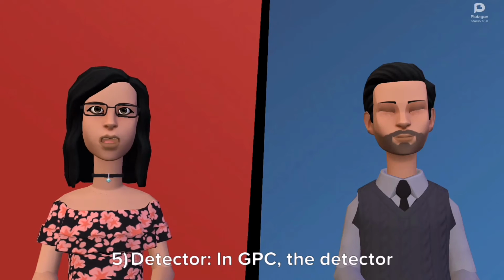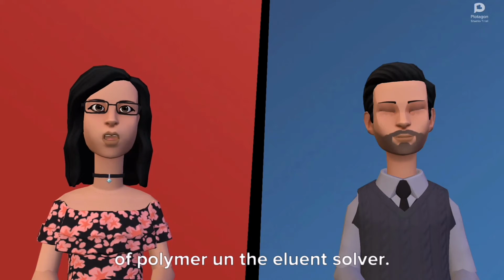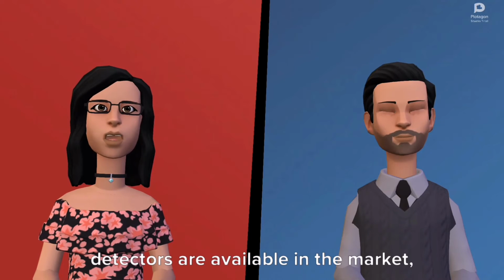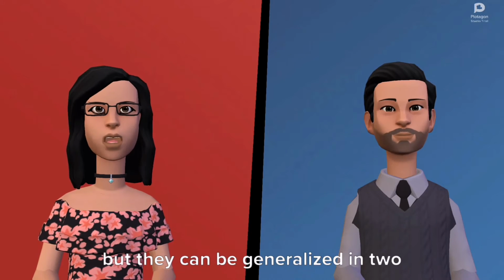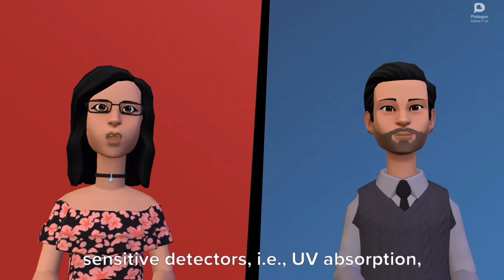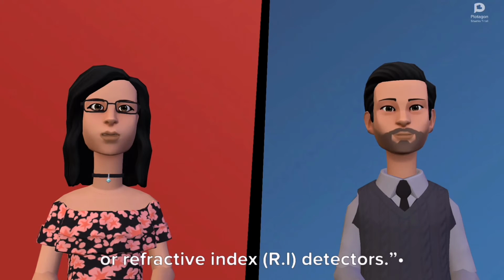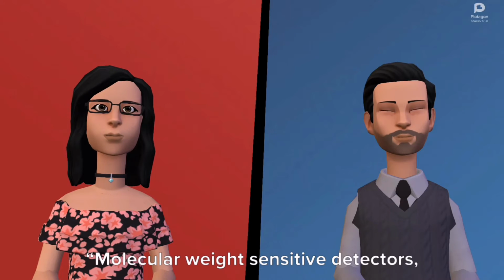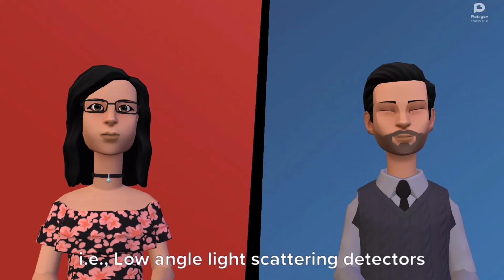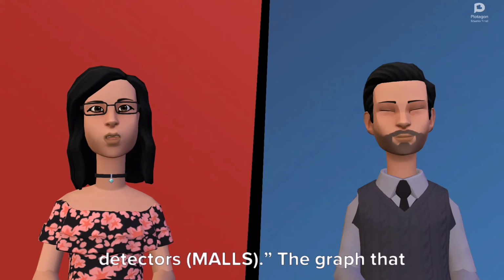5. Detector. In GPC, the detector is used to determine the concentration of polymer in the eluent solvent. Although a wide range of detectors are available in the market, they can be generalized into two major categories. Concentration-sensitive detectors, that is, UV absorption, differential refractometer, DRI, or refractive index, RI detectors. Molecular weight-sensitive detectors, that is, low-angle light scattering detectors, LALS, and multi-angle light scattering detectors, MALS.